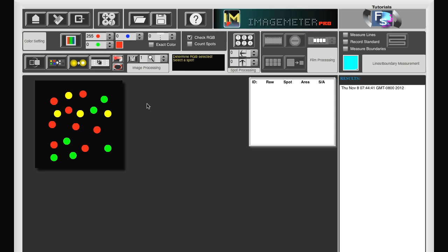If we want to get an RGB value for the number of pixels, we need to set the RGB value lower or equal to the actual RGB value. If we leave R, G and B 0, nothing would be counted and we wouldn't get any value. So to count yellow pixels, we need to set a value for R and G and leave B 0.